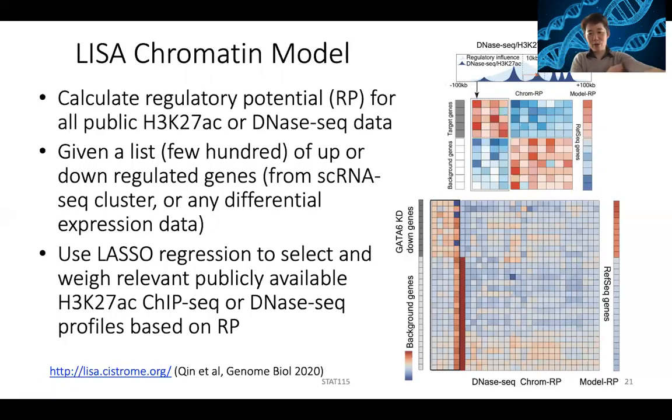It's similar to how you do single-cell ATAC-seq, right? So you look at whether this gene has many peaks and close by peaks to my gene of interest, and the peak height is high, and then we'll just add them together. So it has probably high score. Another gene, this is somewhere else in the genome, there are no peaks, nothing, you have a low score.